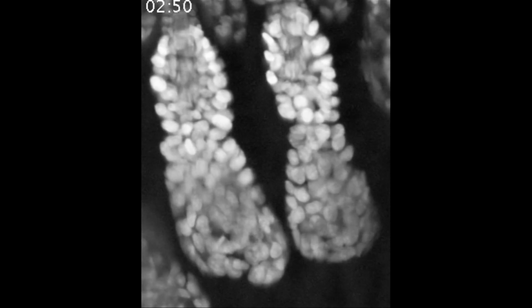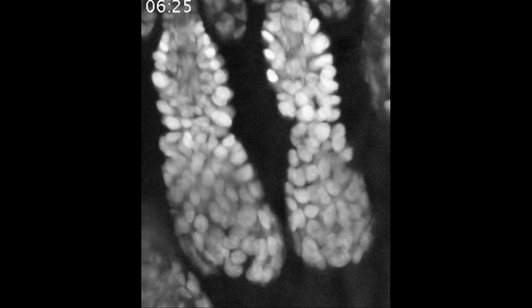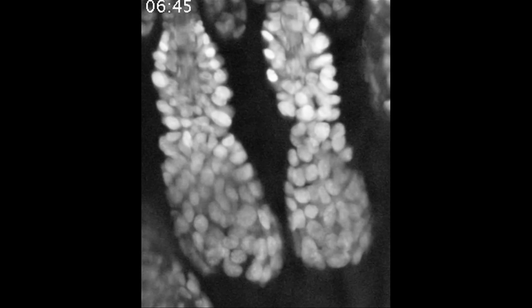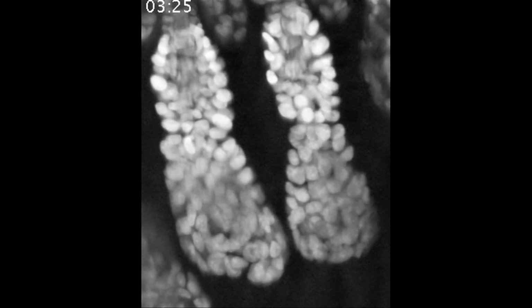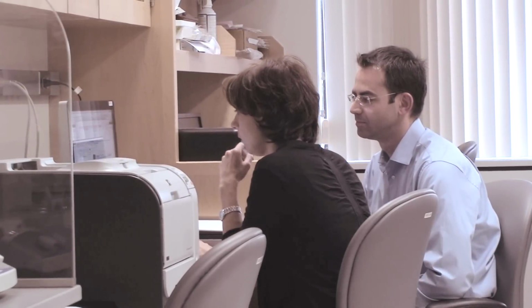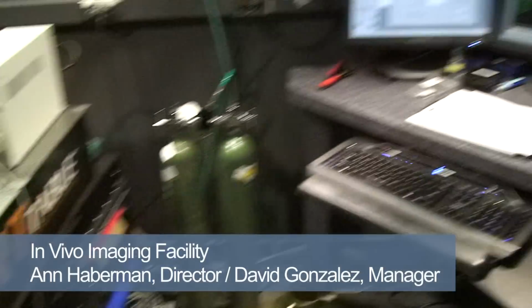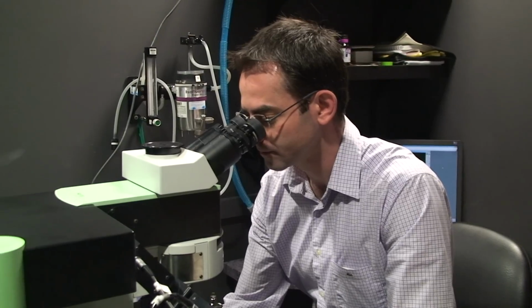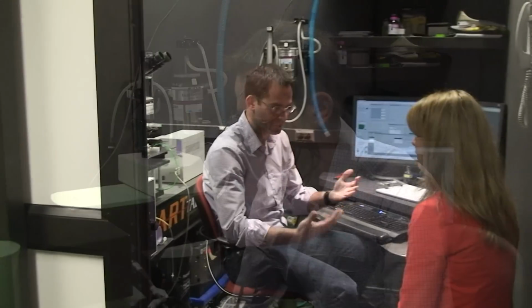So while we know the stem cells and the environment in which the cells reside is critical to this regeneration process, we still lack knowledge of how stem cells undertake the sequential steps that will lead to the tissue to regenerate. We've only had snapshots of these very dynamic processes. And now, using the two-photon microscope and special transgenic mice, we're able to visualize how stem cells and their progeny and other cell types behave during the regeneration process.